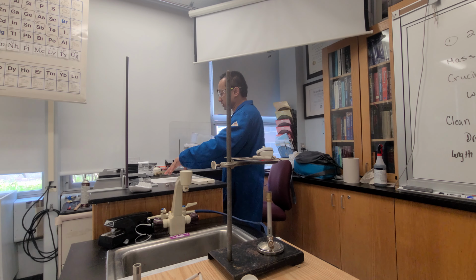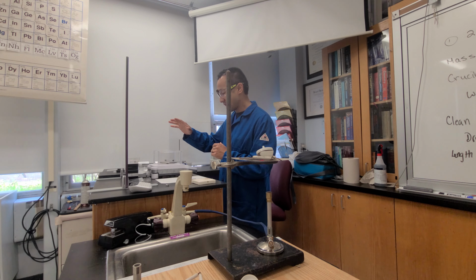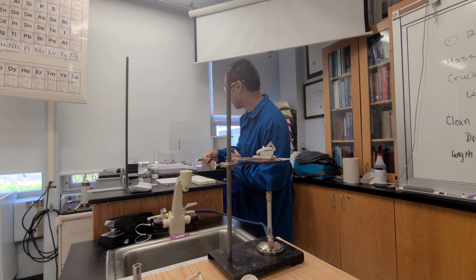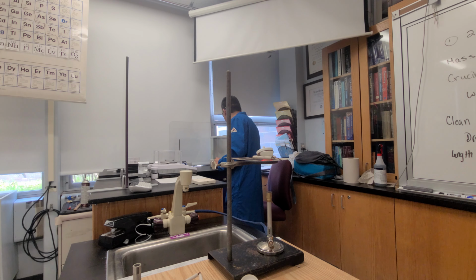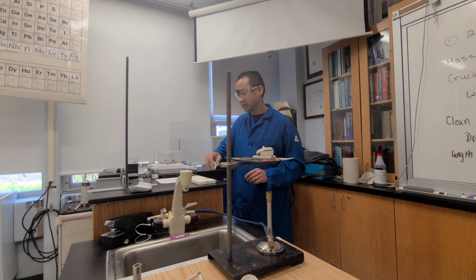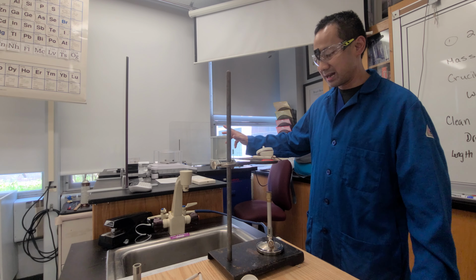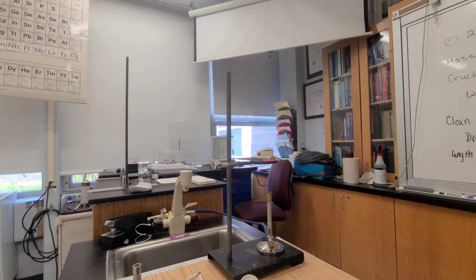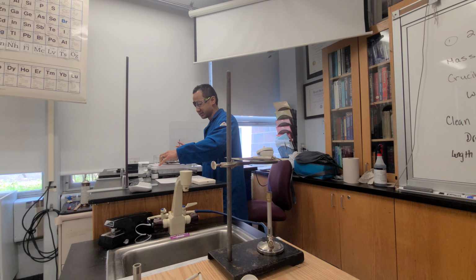Now remember, so that we can be reminded, what I did was take a measurement of 0.1910 from the plain magnesium here. And then I'm going to do this, but this is actually going to be a kind of check, okay? The scale is essentially just going to let me get some generic measurements kind of in line.